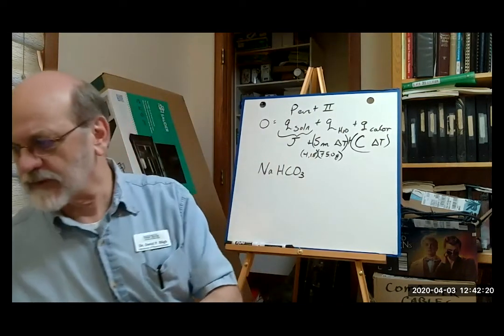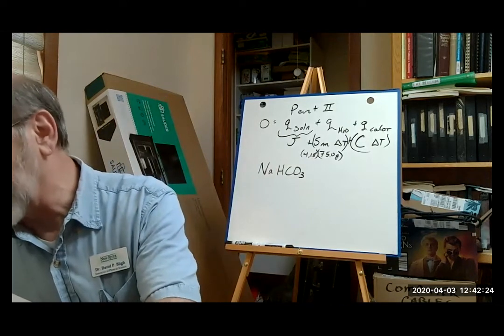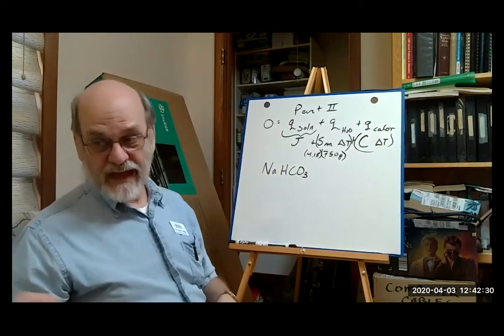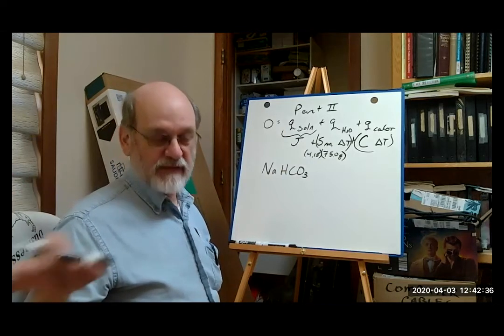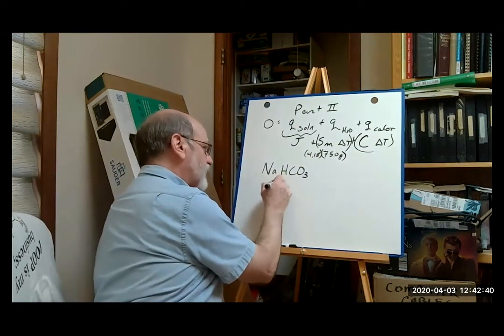So, how many grams of this one are we going to use? Well, let's see. It's different, I am convinced. It's approximately 7 grams. You get the exact value from the data set that is in the file in Blackboard. So approximately 7 grams.